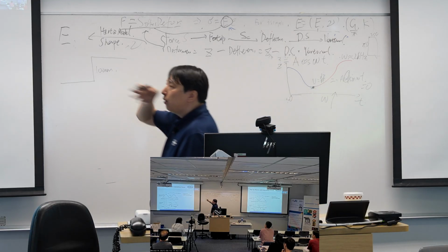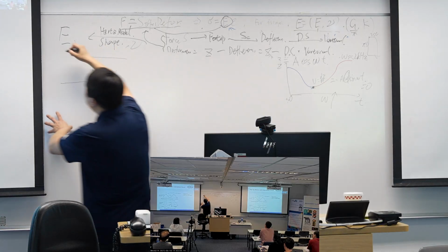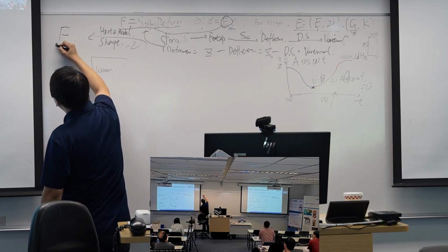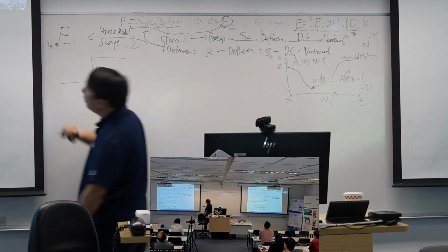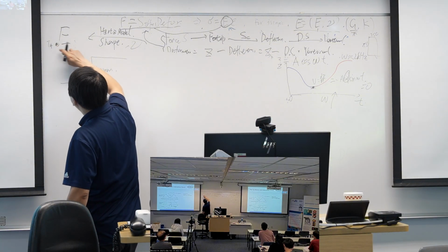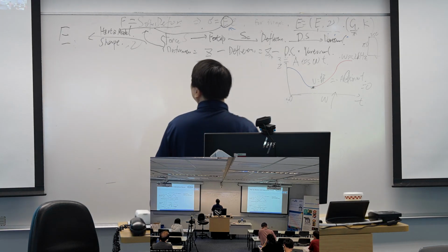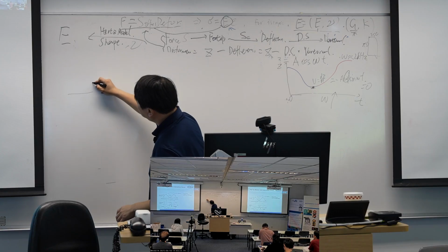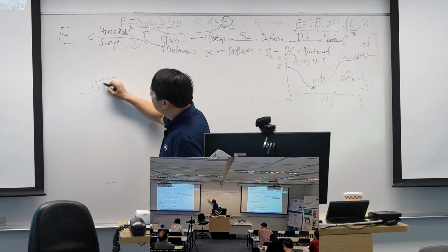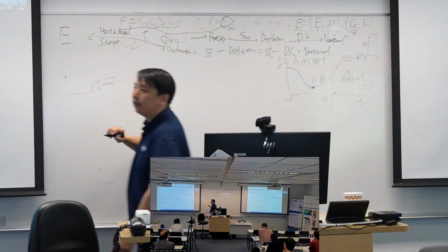And then we try to capture an image of this sample. So we do the setup something like this. Our probe, the initial point is somewhere here. We can see it, right? The step height is 100 nanometers. The probe is somewhere here.